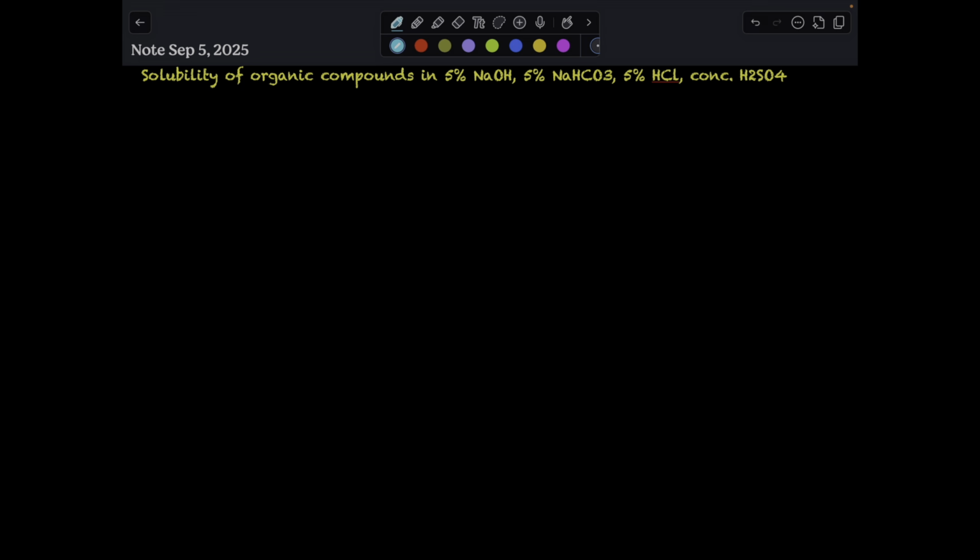In this video, we are going to study the solubility of organic compounds in 5% sodium hydroxide, 5% sodium bicarbonate, 5% HCl, and concentrated sulfuric acid. Now, let's look at 5% sodium hydroxide and 5% sodium bicarbonate.